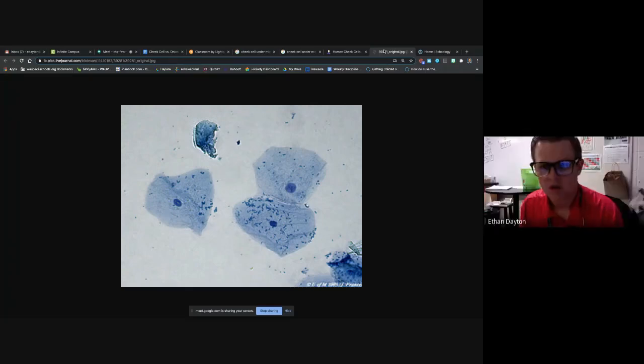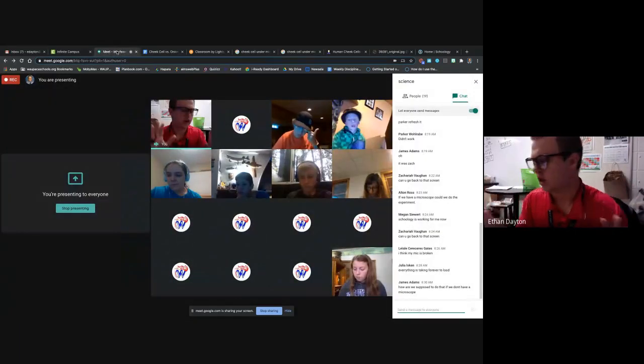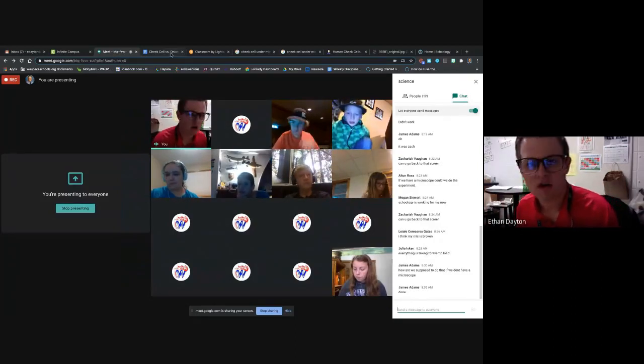All right, I'm done. Okay, cool. We are not doing high power. Do not worry about high power. Just not worrying about it today. So we're moving on to the onion cell.